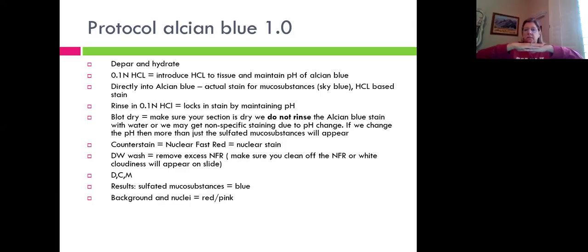When it's dry, take your finger and just press on the bottom of the slide, and the slide will kind of pick up a little bit. And then just with your finger, grab the other end and stand it up instead of trying to swipe it off like this. So you press on that end, this end of the slide will lift, reach your finger down, and stand it straight up.